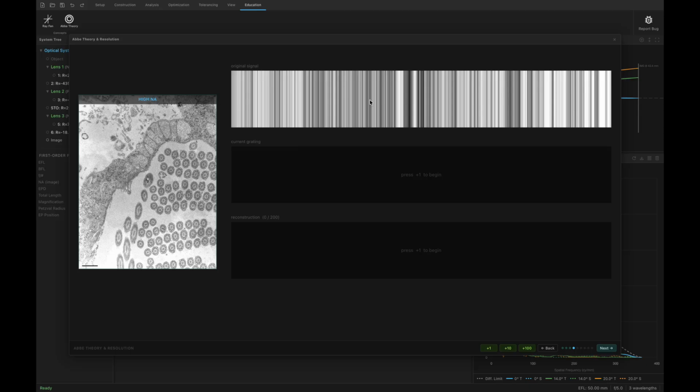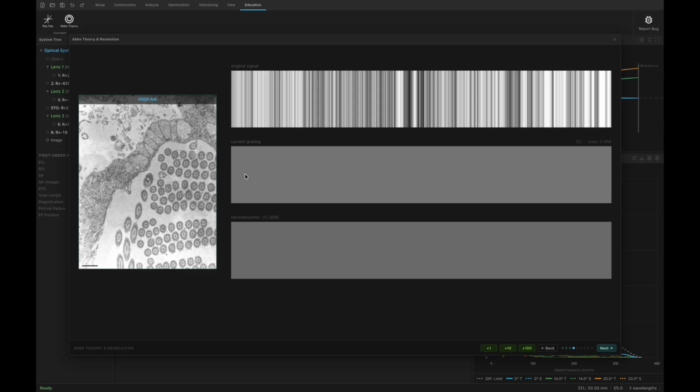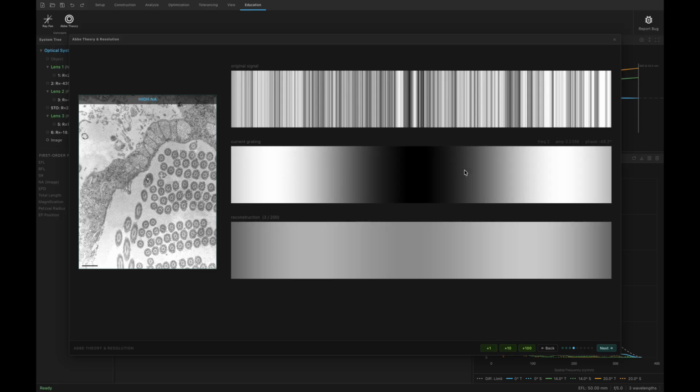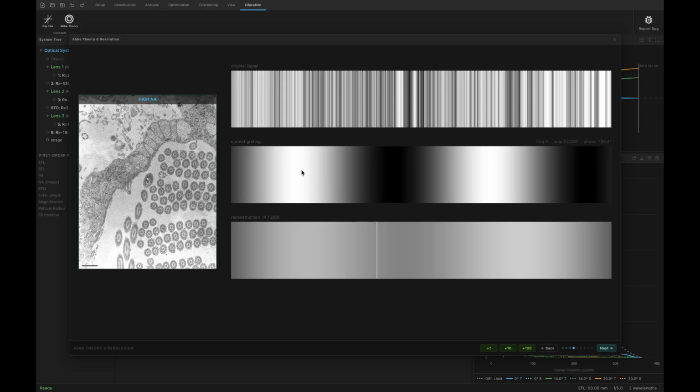And you could do the exact same thing with this image, because all we did before is represent brightness with a graph to make it look like a function. But we can do the exact same thing, but instead of adding sine waves, we add the image form of a sine wave. The flat line would look like this. But the frequency 1 sine wave looks like this. It's dark, it gets bright, it gets dark. And the frequency 2 sine wave looks like this: bright, dark, bright. And frequency 3 sine wave.